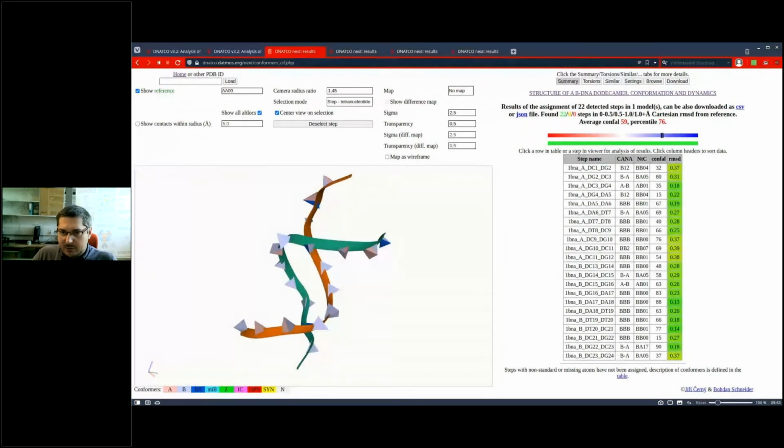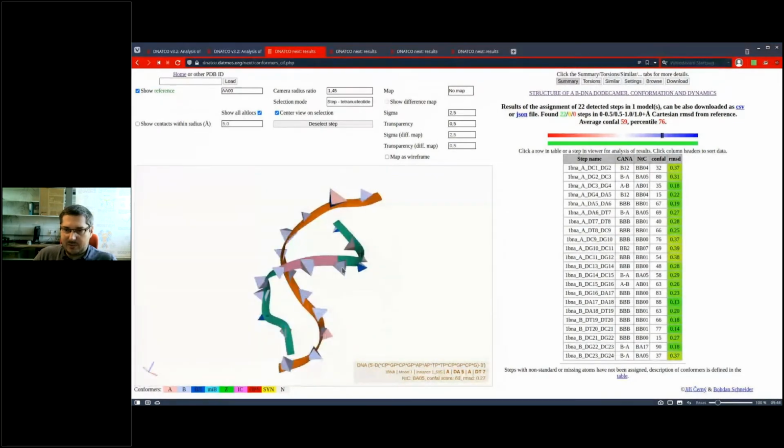Maybe I already showed that if you hover over the step or over the pyramid, it also shows the summary information, the NTC and the scores in this window below. When I move the cursor, it disappears. So it's like the information is shouting at you from different places.